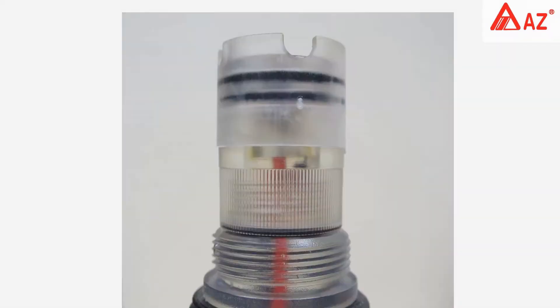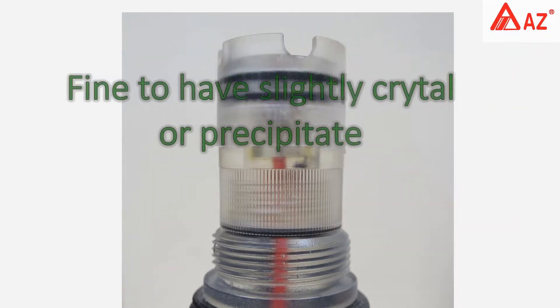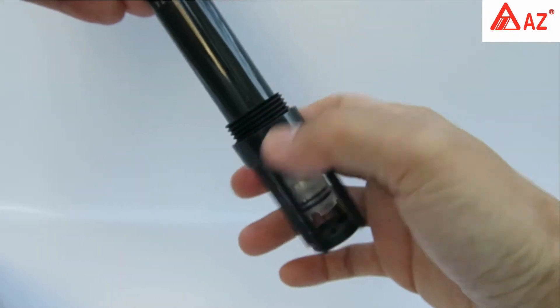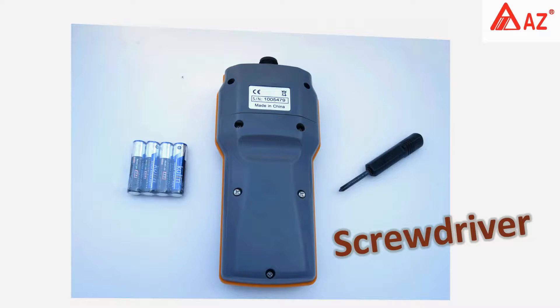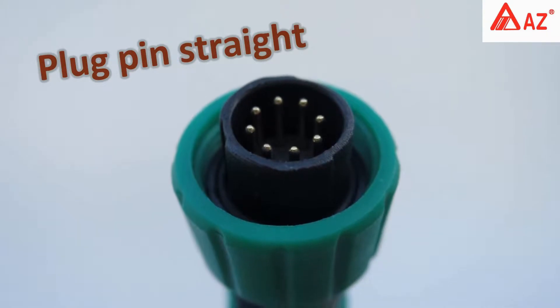Check that electrolyte is more than half height. It is fine to have slightly soft crystals or precipitate. Screw on the protection hood after inspection. To begin setup, open the cover with a screwdriver and insert batteries.